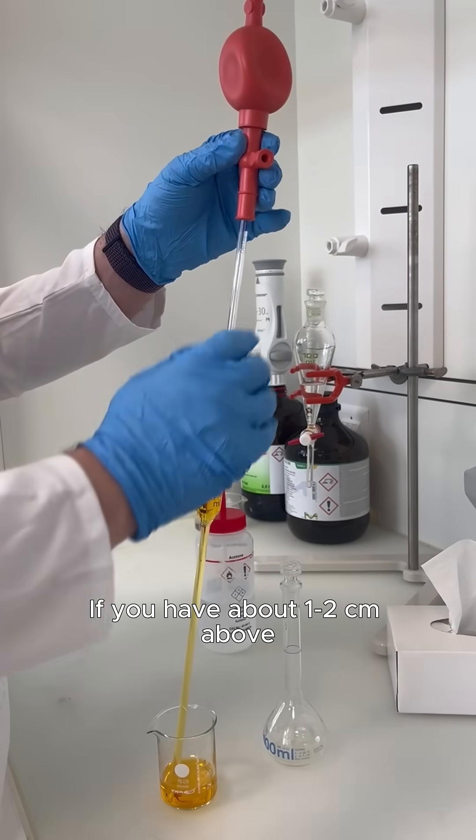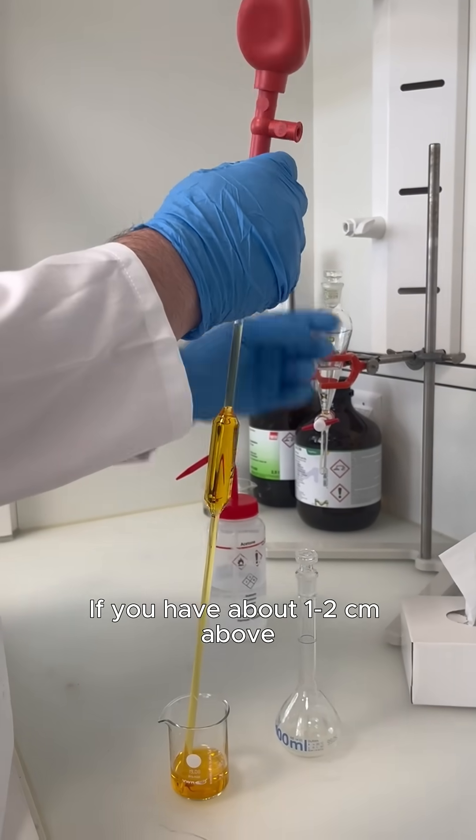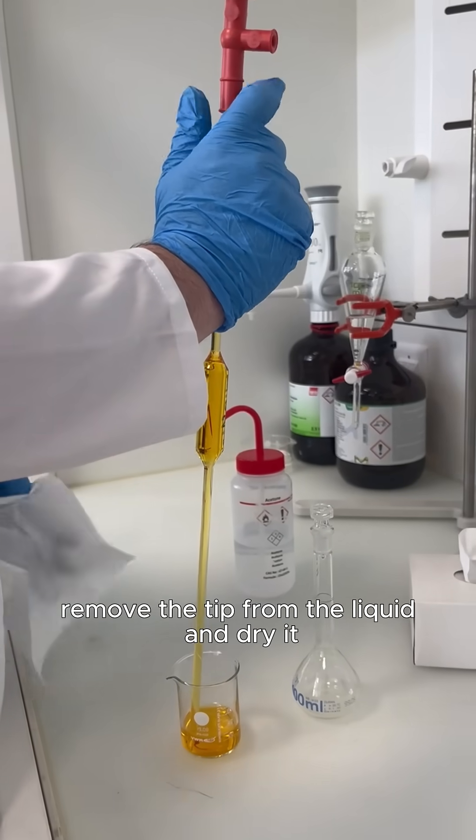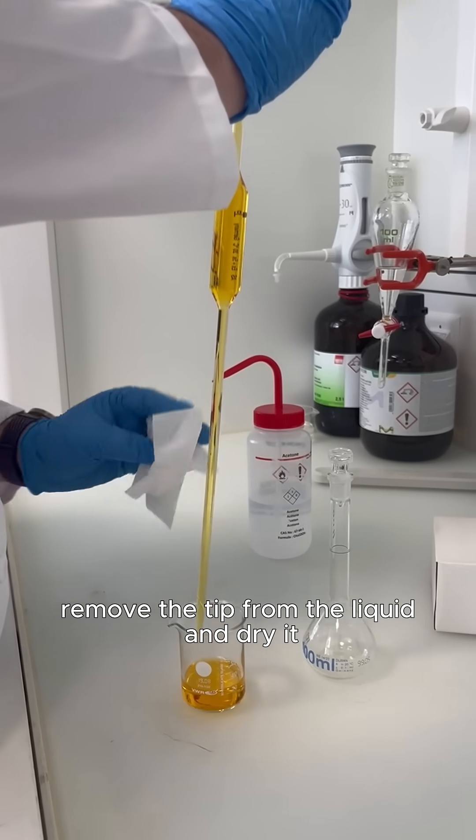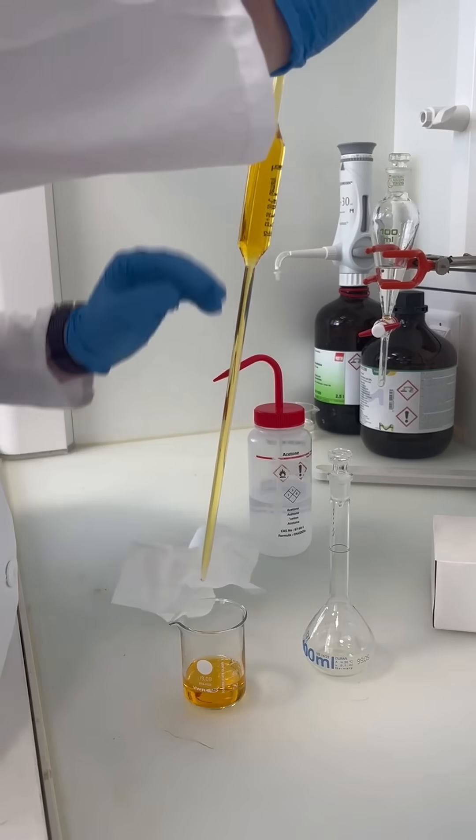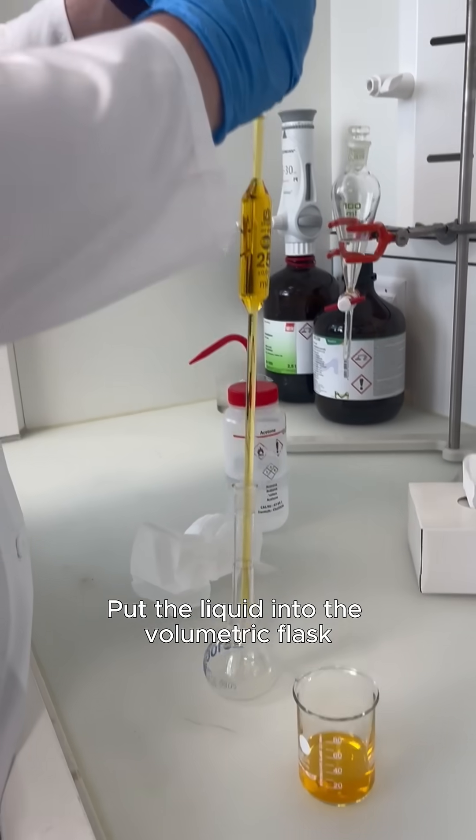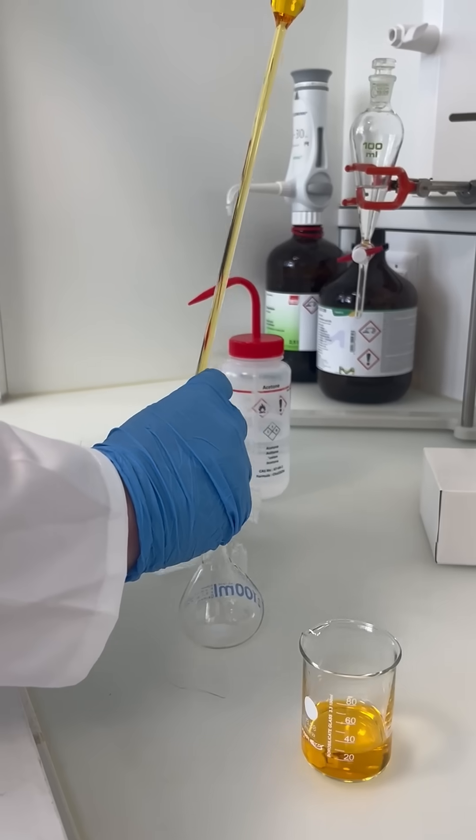If you have about 1-2 cm above, remove the tip from the liquid and dry it. Put the liquid into the volumetric flask.